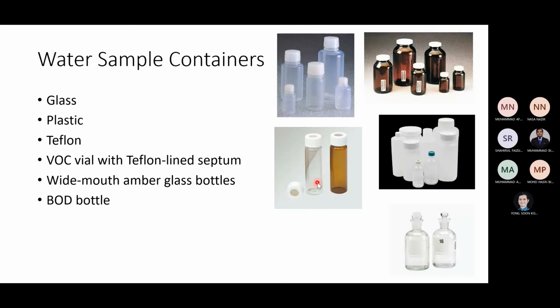Of course, the other one may be for analyzing total organic carbon or dissolved organic carbon or whatnot. But let's start with the popular ones. This one is the small plastic bottle. Wait, I think this one is Teflon. If you don't know how Teflon looks, this is how. You thought it's dark colored, right? Because your non-stick cookware is black, the membrane is black. They are actually colored. The original color of Teflon is actually like this, just like any other plastic.